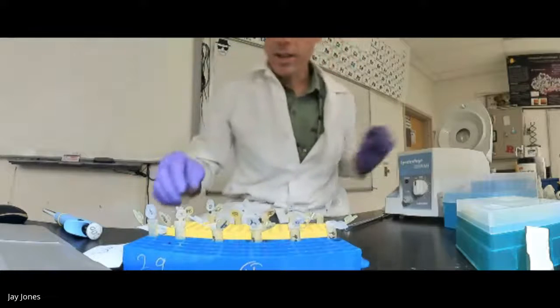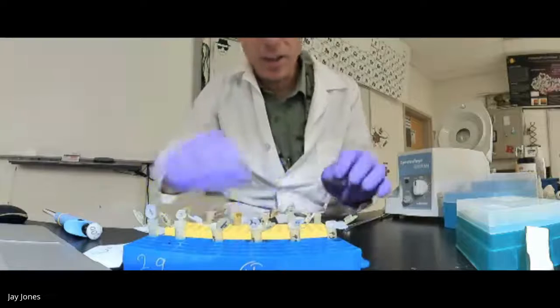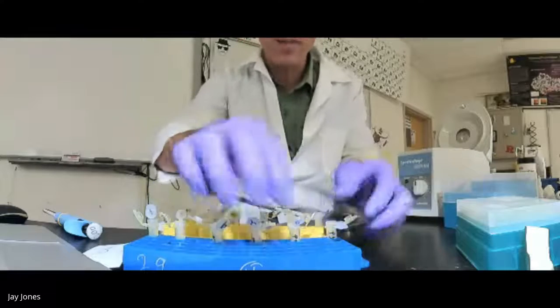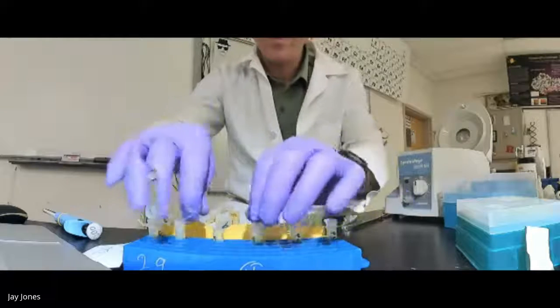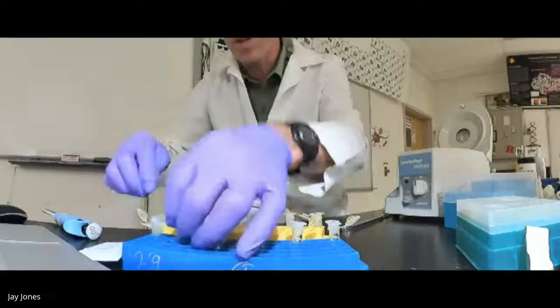Done with that. Let's cap these up and let's elute the DNA off the column and into these final yellow collection tubes.